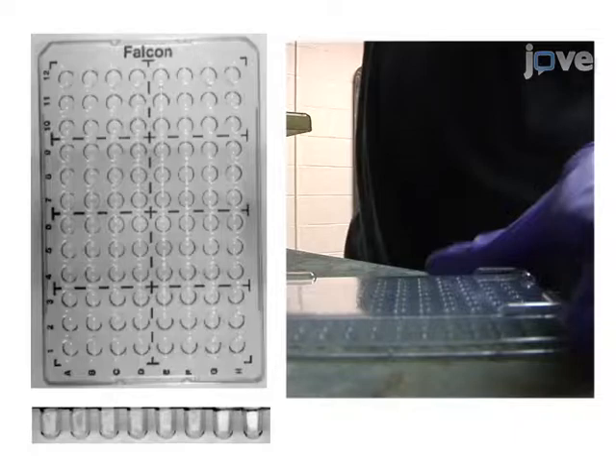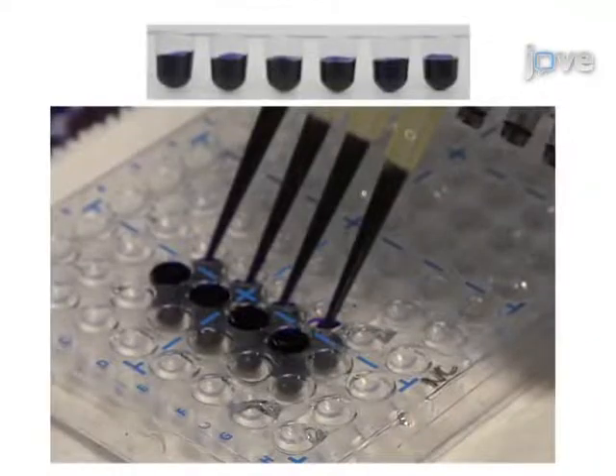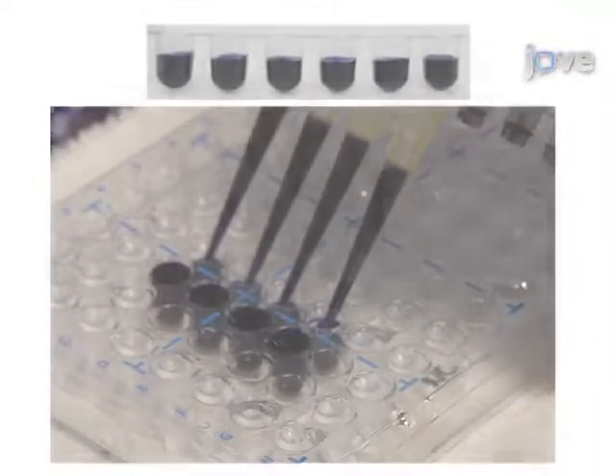Next, the culture is incubated at the appropriate temperature and time depending on the microbe. To stain the biofilm, crystal violet is added to each well of bacteria and then the bacteria are washed.